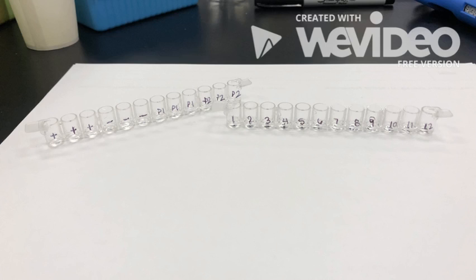Going back to the first well strip, 50 microliters of phosphate buffered saline is pipetted into the wells labeled 2 to 12. 100 microliters of the primary antibody is added to the first well, then 50 microliters is consecutively pipetted out of the initial well into the next. The process stopped at the 11th well. The leftover 50 microliters is discarded.